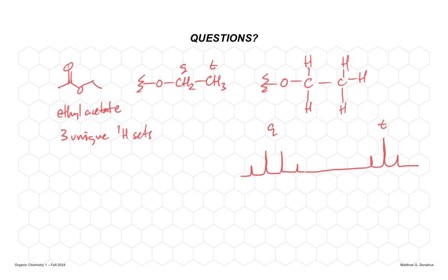We understand now the reasons why the lines have the intensities, and then the distance between these lines. So what I marked in blue, that has to be the same distance within that signature. And it also has to be the same distance here for the other one.